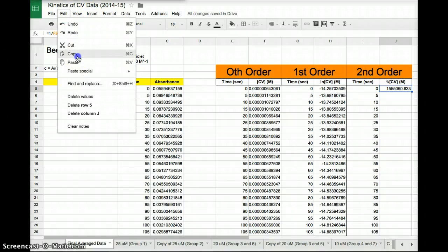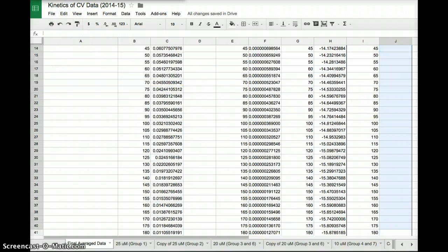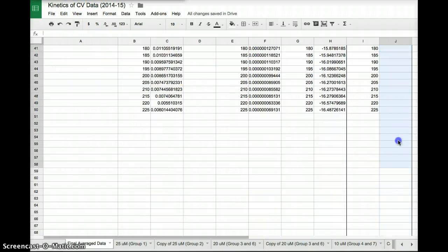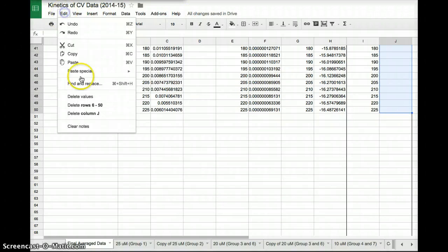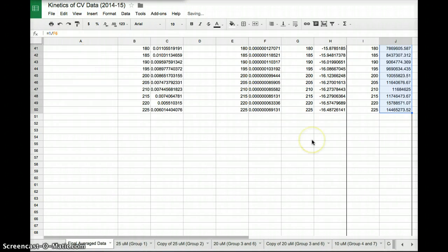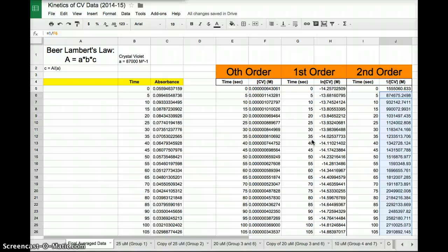I'm going to edit, copy that function, and I'm going to paste it all the way through. Boom. To get those data points. Cool. So now I have all the tables with all the data that I need to make these graphs.